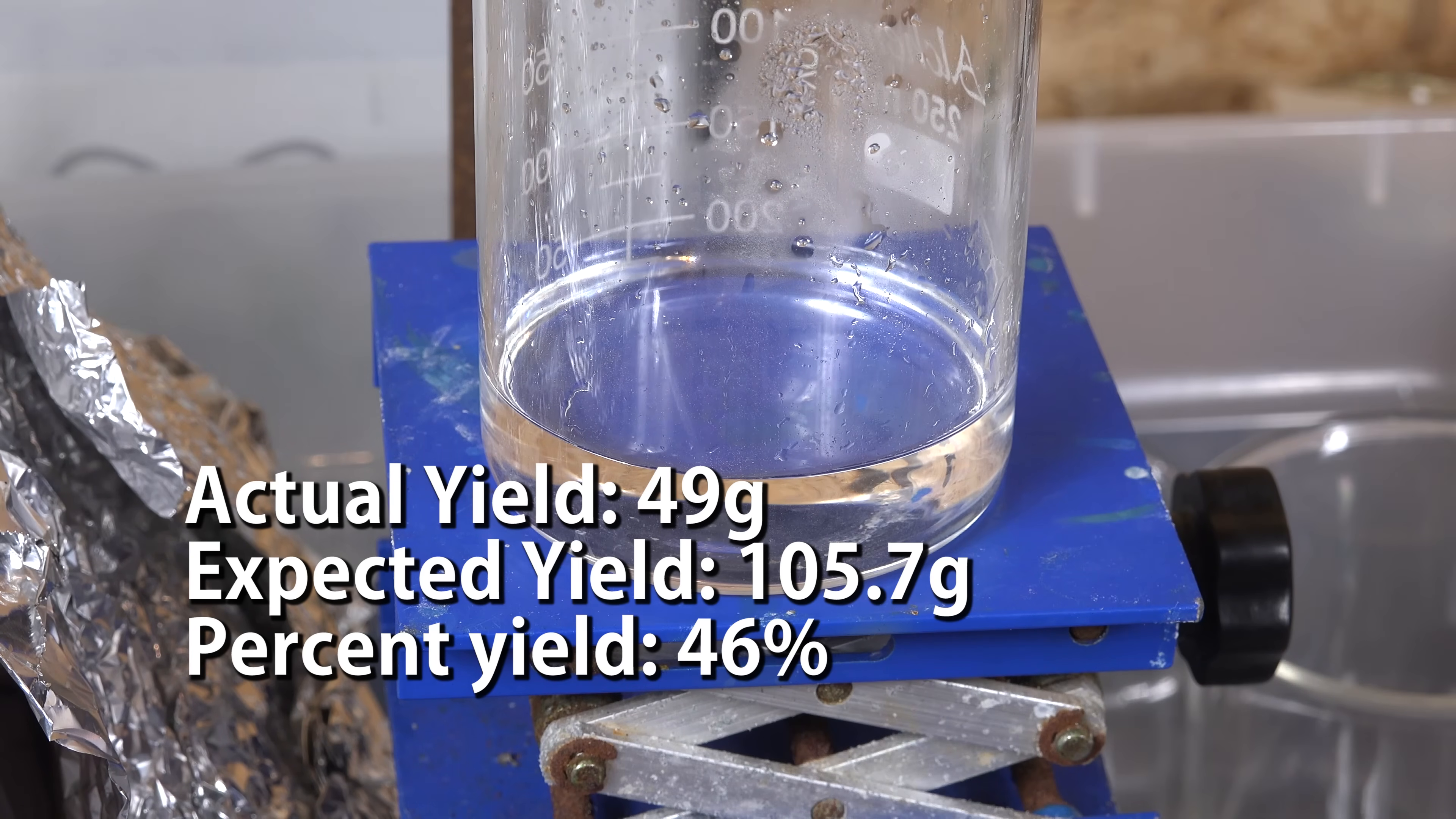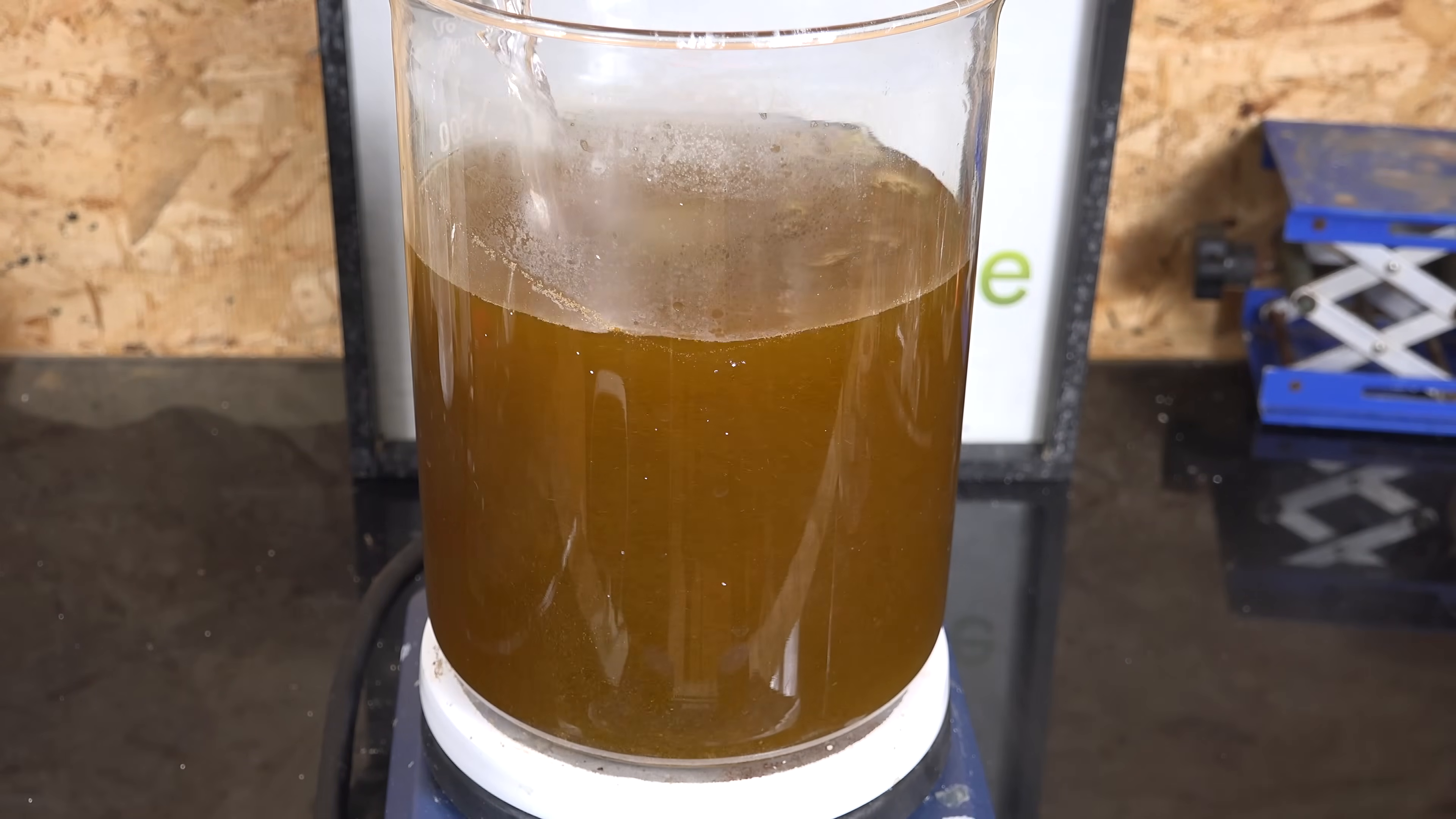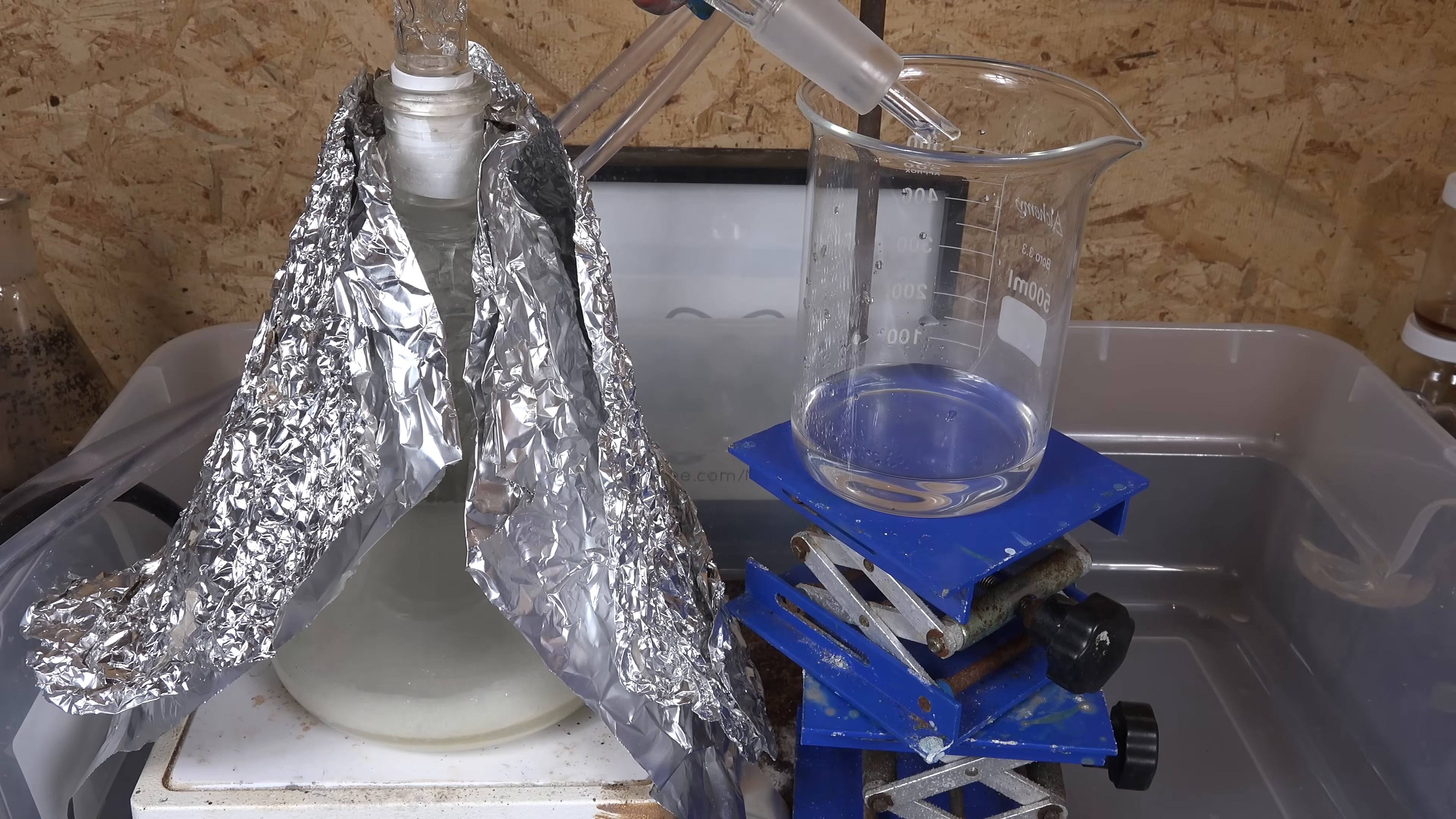The expected yield was about 105.7g, so our yield was 46%. So the yield isn't terrible, but considering we had to process 450g worth of chemicals just to get a tiny amount of acid, I don't think it's viable overall. But I'll leave that choice up to you.